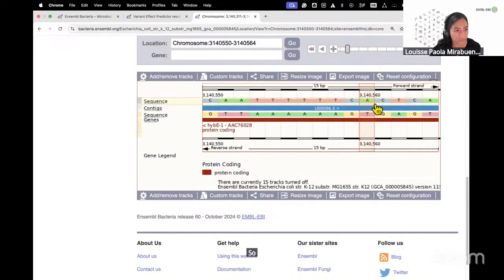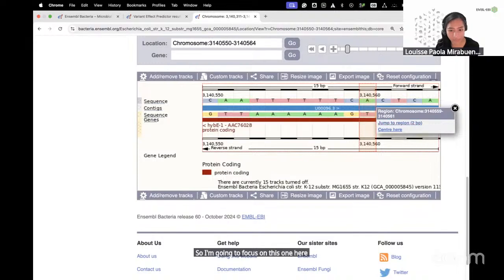I'm going to focus on this one to highlight it for you. Okay, so what I've just typed into the chat is a variant that I made up for this particular base here. So you need to write it in this format.